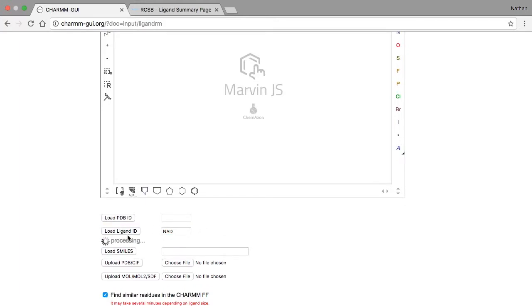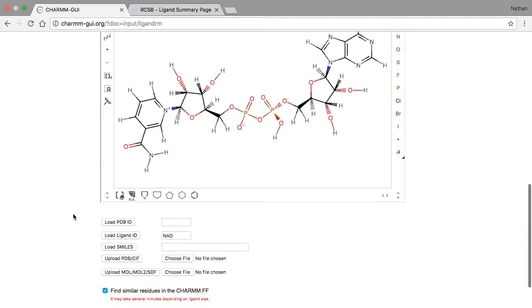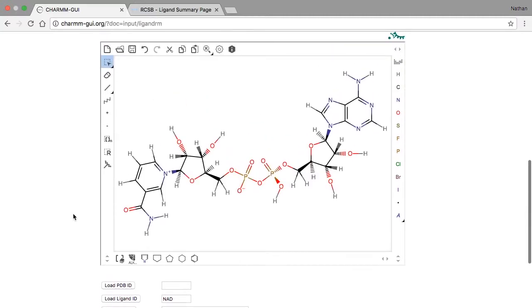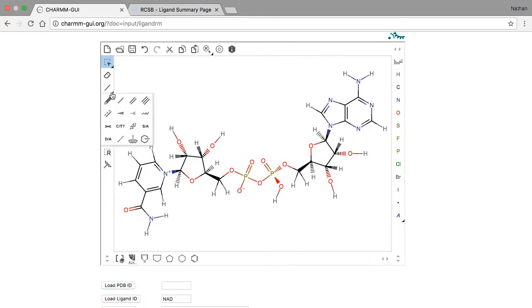We can edit the structure just like we did in the previous video. This time, let's see what happens if we try to change the chirality of one of the chiral centers. Here, it's important to remember that the solid wedge indicates a bond that is oriented towards the viewer, and a dashed wedge is for a bond oriented away from the viewer.